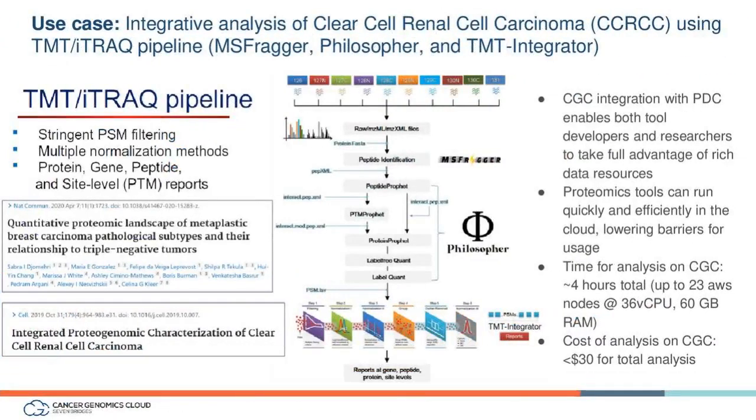I wanted to highlight another use case, which is our successful integration with the Proteomic Data Commons. You can see that this is a paper that was published on the quantitative proteomic landscape of breast carcinoma subtypes.